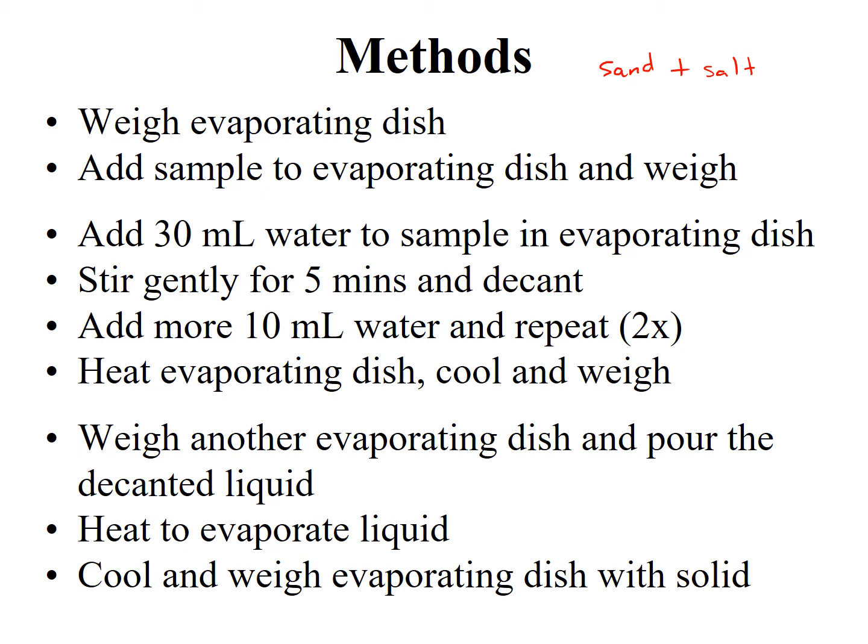You add another 10 ml of water, and then you stir it gently for 5 minutes and then you decant. Then you add another 10 ml of water. Okay? And then you stir it gently for 5 minutes and then you decant. So overall you add what? 50 ml of water. Once you do that, what is left now is the sand that still has traces of water in it.